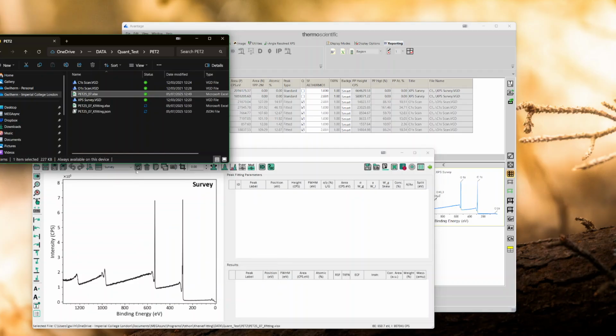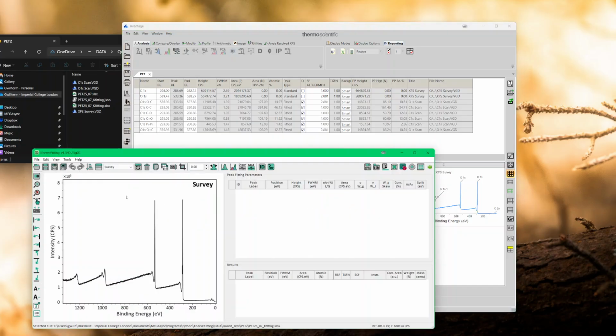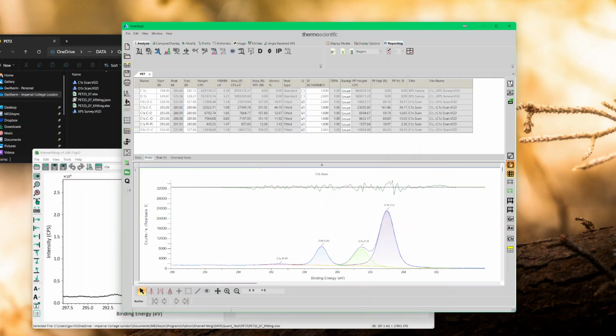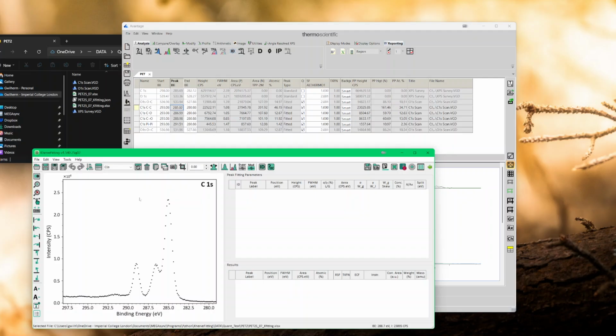So that's it, it's happening, and then you have PET25 KherveFitting that is created. And you will also see that, for example, here it goes up to 8 to the 5, and that's exactly what we get, 8 to the 5 here. And if we go to carbon 1s, it seems to go to 2.5 to the 4. And this is what we get here, 2.5 to the 4, if I zoom to it. 2.5, 25,000. Okay? So it is like for like.